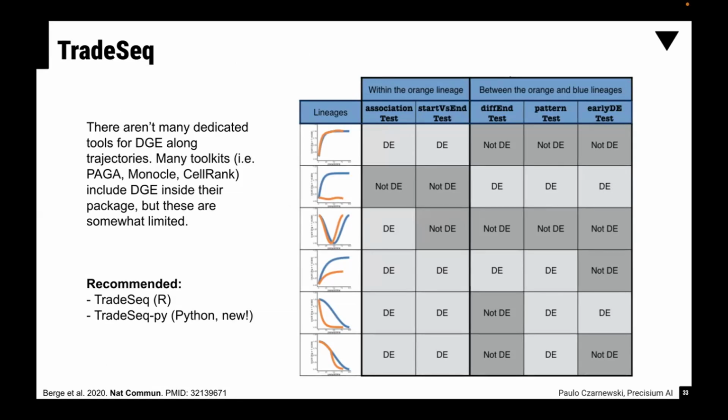Do we have to run the differential gene expression analysis per gene, or can TradeSeq integrate it by itself, recognizing that this subset goes down in this trajectory and this subset goes up, or do we have to run it one by one?